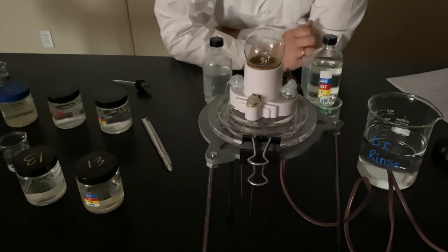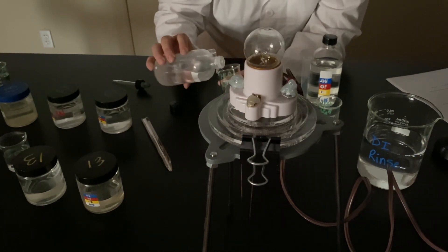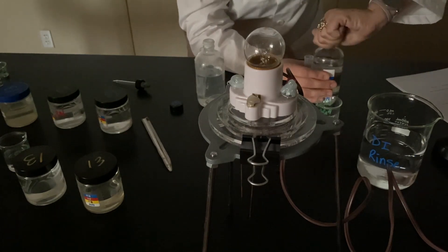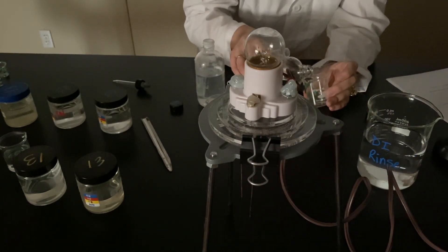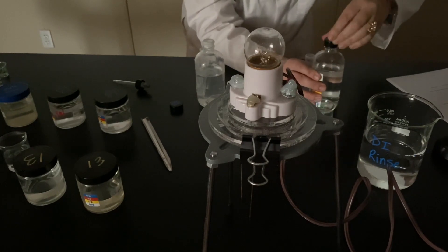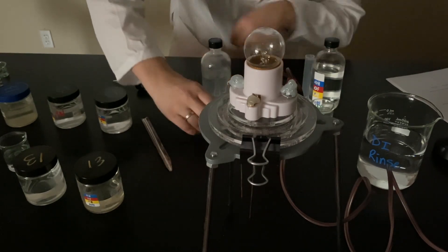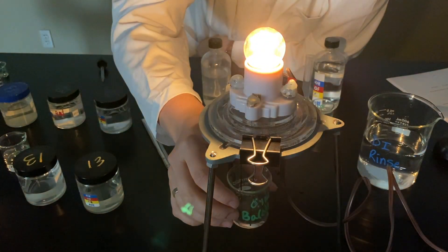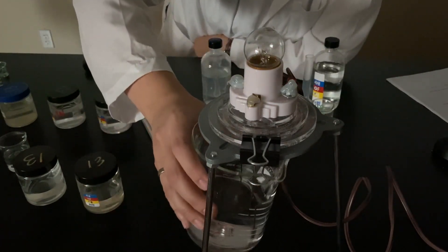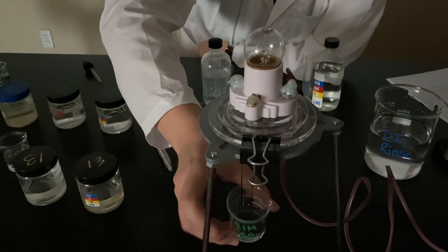This is our last double replacement reaction. I'm basically just filling up the bottom of the tiny beakers — I want as little as possible, you'll see why. We have barium hydroxide and sulfuric acid. I'm going to test barium hydroxide first by itself, then rinse this off and test sulfuric acid by itself at 0.1 molar.